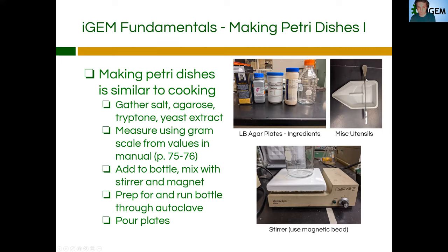So next I wanted to briefly cover making petri dishes. These are the different ingredients: the salt, agarose, the tryptone, the yeast extract — and this is typically the size of the bottle you're going to be making this petri dish with. You're also going to need some miscellaneous utensils: a stirring rod or measuring rod, a weighing boat, and some sort of magnetic stirring bead. You'll also need the stir plate — the magnetic bead goes on top of the stir plate, you turn it on, and it starts spinning the magnetic bead so you can mix your broth properly. First gather all your ingredients and measure them out — you can find this procedure with all the gram values for each ingredient in the lab manual — and with the weigh boat, add them to the bottle. You can find that on pages 75 through 76 in the lab manual.